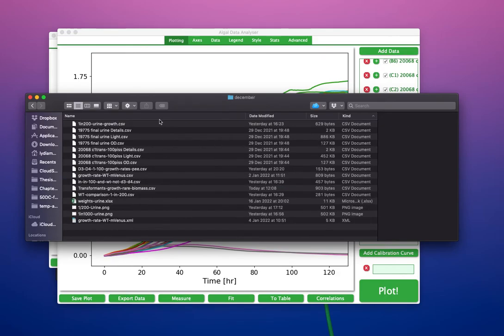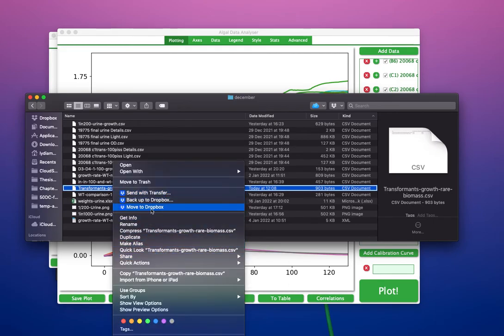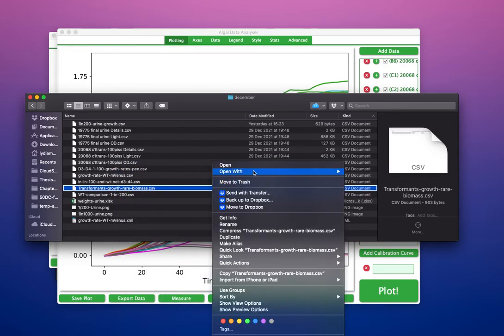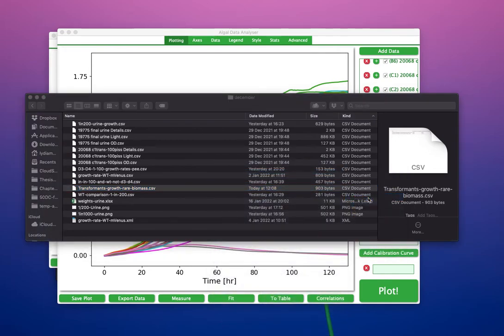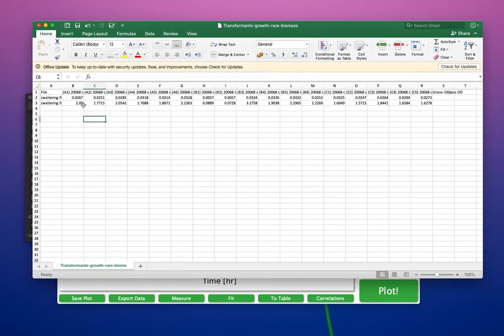December, and here we go. I'm going to open this up in Excel somehow. Yeah, there we go at the top. That's been annoying. And if you give it a second, Excel comes up. Great. So now what we can do is average.